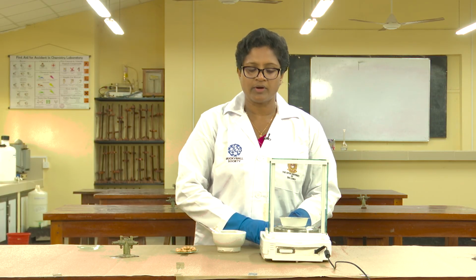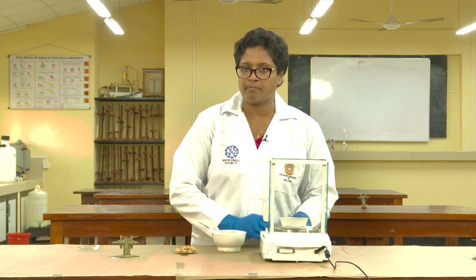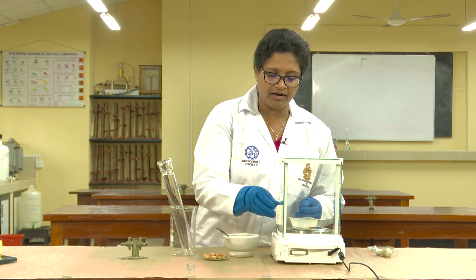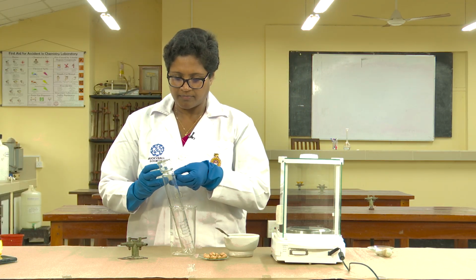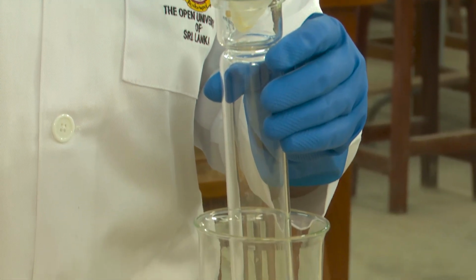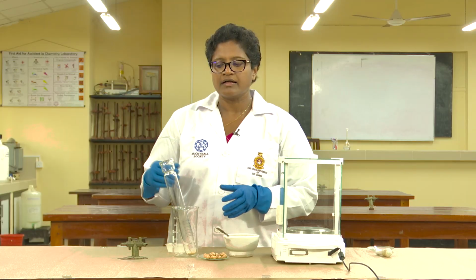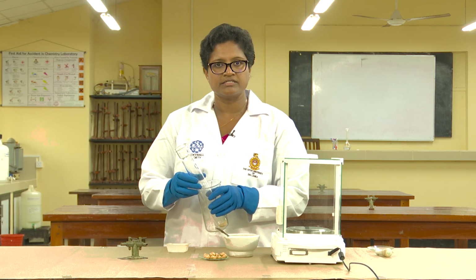You have measured accurately 1.080 grams of your solid food sample. Then you have to transfer your accurately weighed food sample into the Kjeldahl digestion tube. Then you have to add 25 milliliters of concentrated sulfuric acid into the digestion flask.